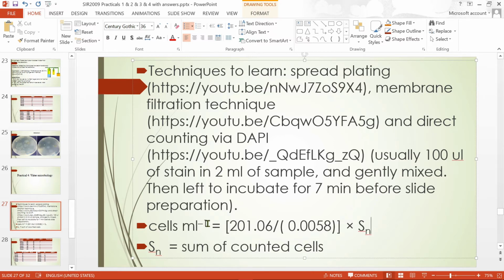of the water sample. Okay, so because this is the filterable area and this is the microscope field, if you are using a different microscope, or different lenses, or a different kind of filtration set, you have to remeasure the diameter of these areas and calculate the area again.